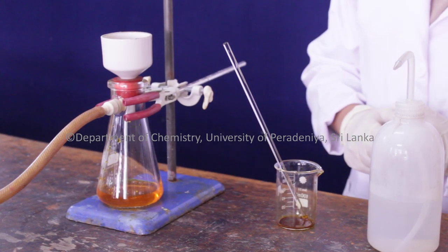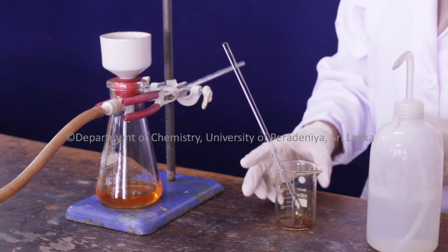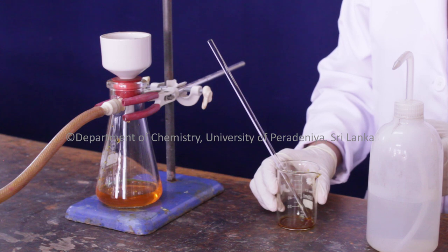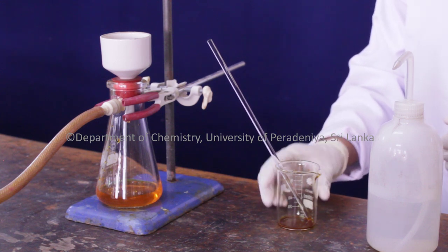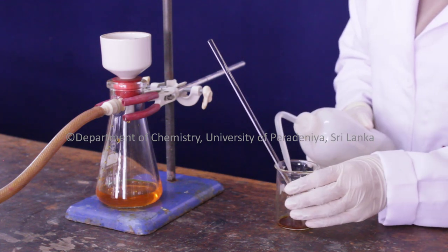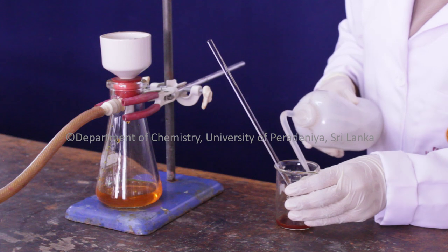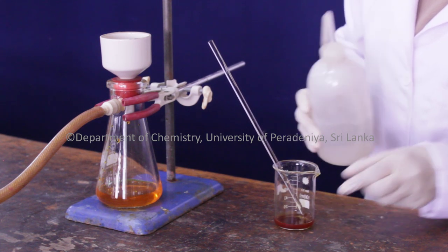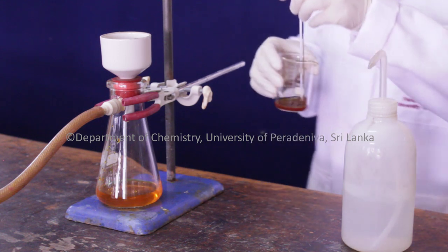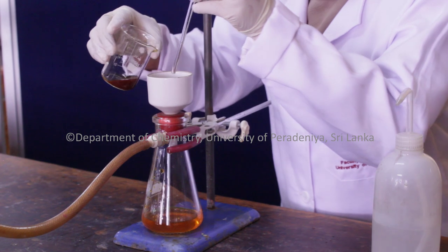After the addition of the whole solution in that way, the inner wall of the container is washed with the same solvent, and those washings are added to the same funnel. Let the filtration process continue.